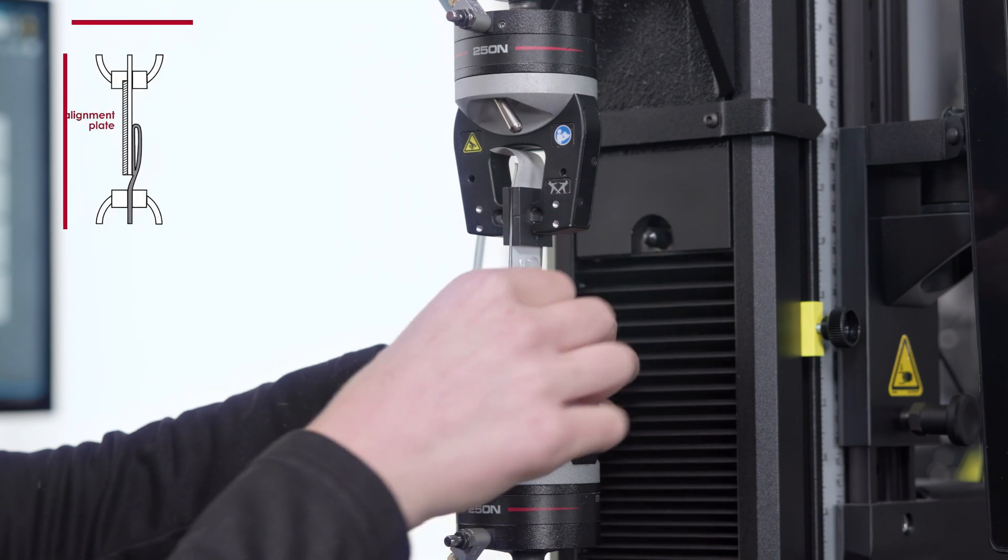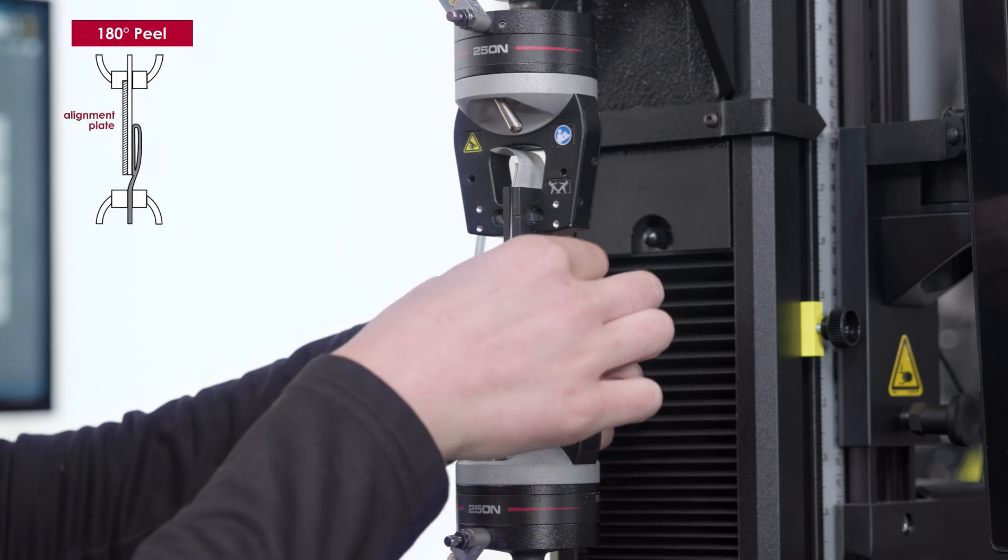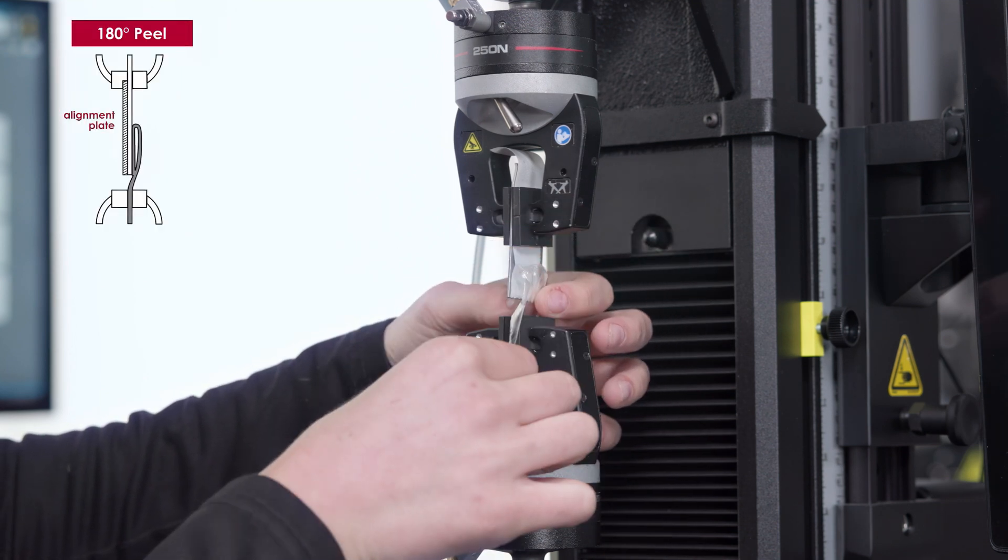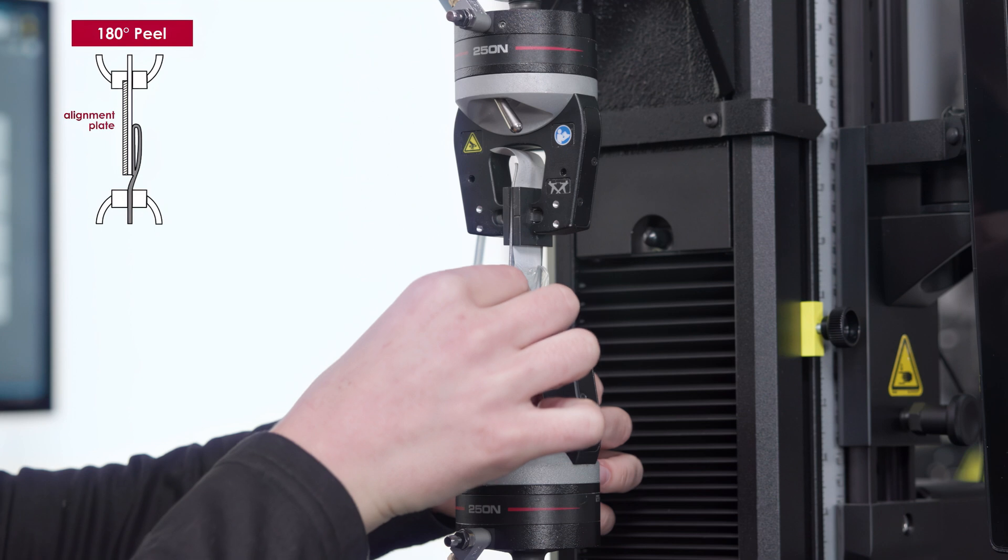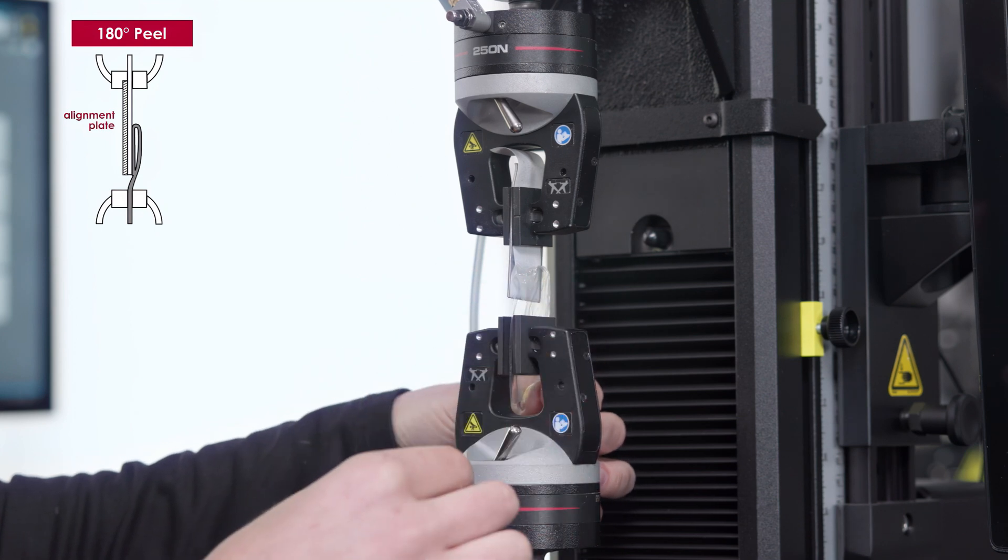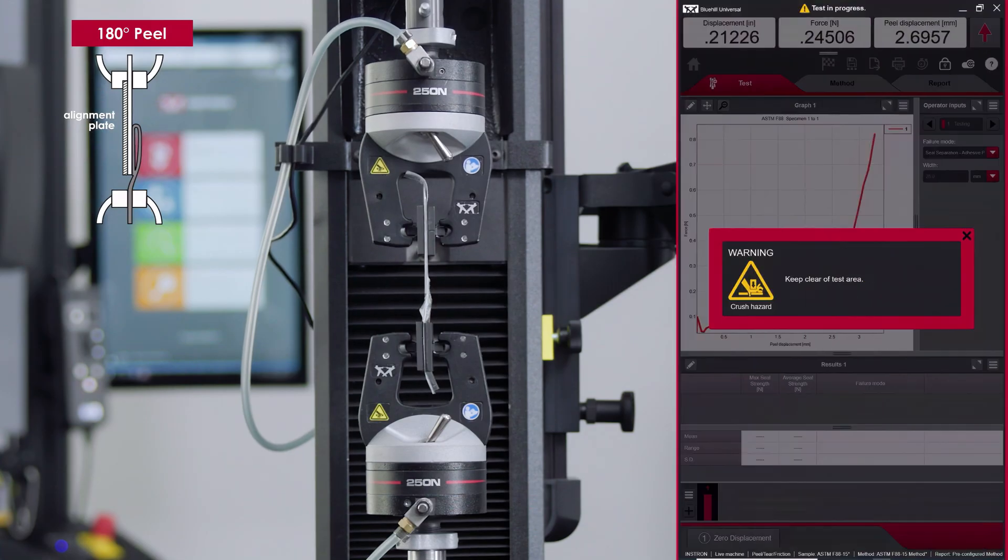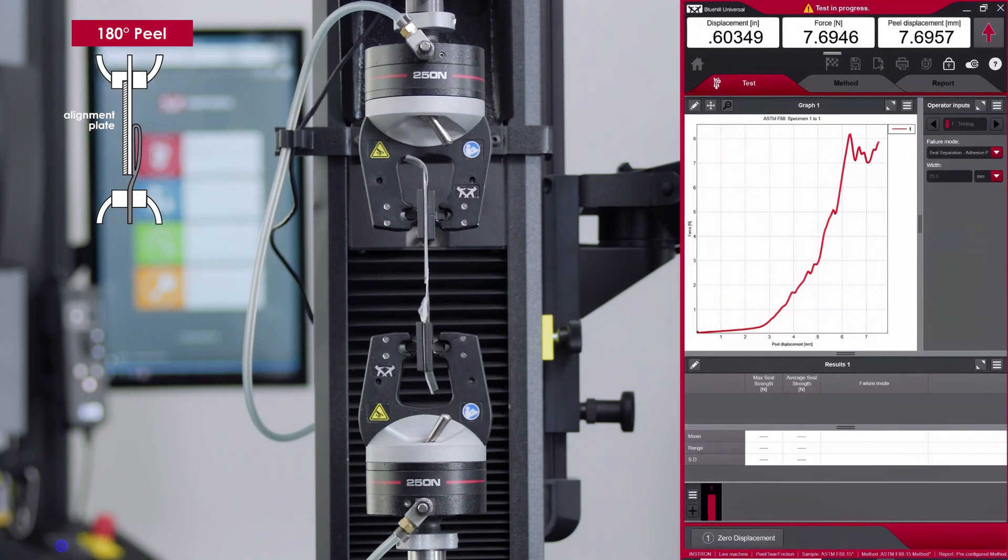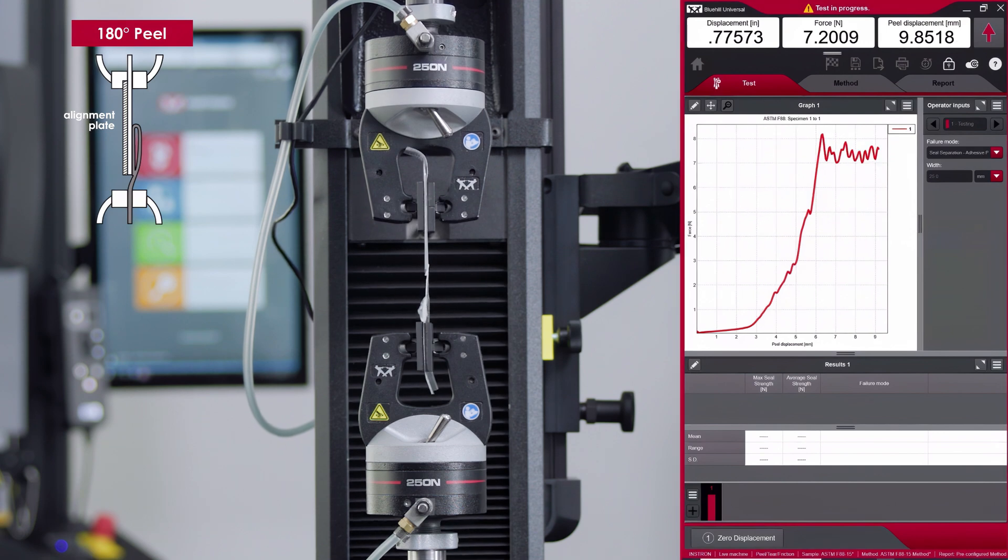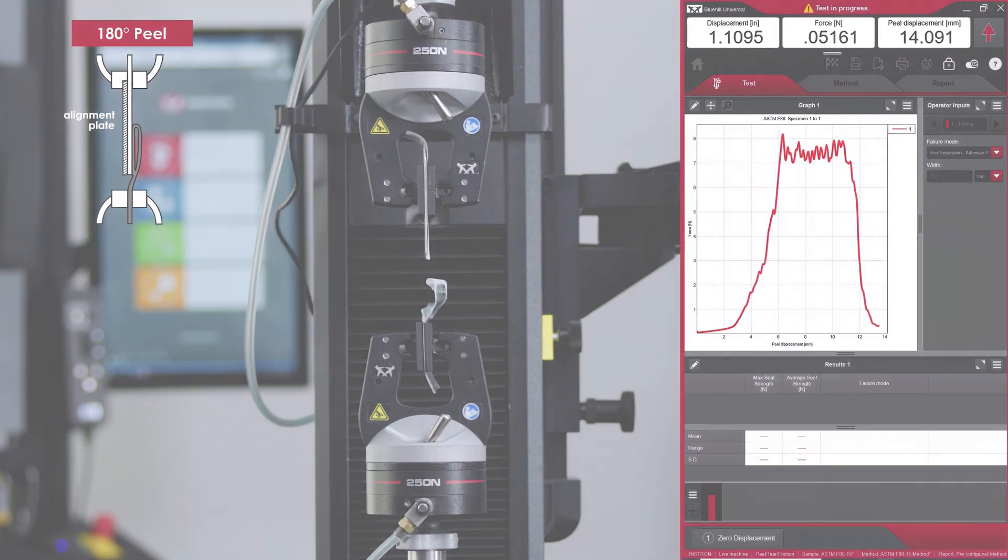For 180-degree peel testing, the least flexible tail is supported flat against the rigid alignment plate held in one grip. The more flexible tail is folded 180 degrees over the seal and is held in the opposing grip.